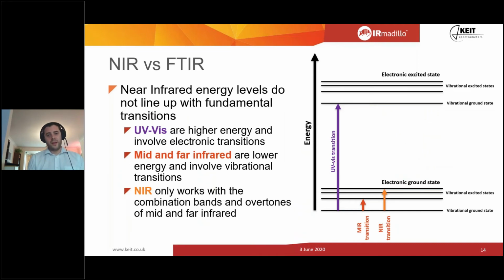Some of you may be sat there thinking, yeah, we heard all about infrared before. It was going to fix everything, and it didn't. I tried near infrared and it was awful. It was expensive. It took me ages to calibrate. It didn't work. I must stress this: near infrared and mid infrared, or FTIR as it's sometimes called, are different. They are very, very different. Unfortunately, the infrared part of their name is the same, but they are very different. They're both based on vibrational information, but the quality of the information is completely different.